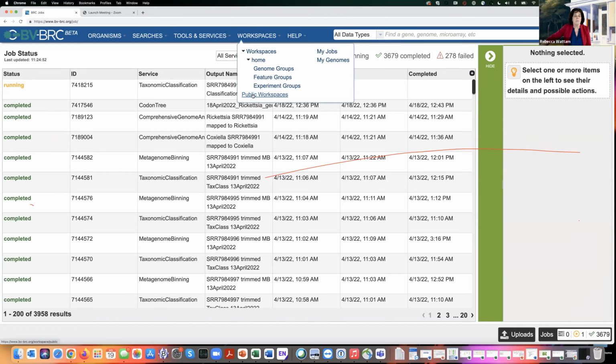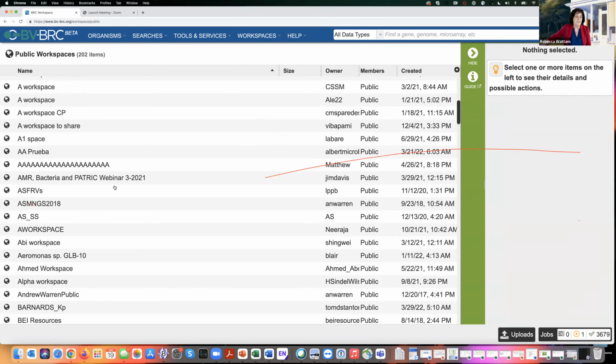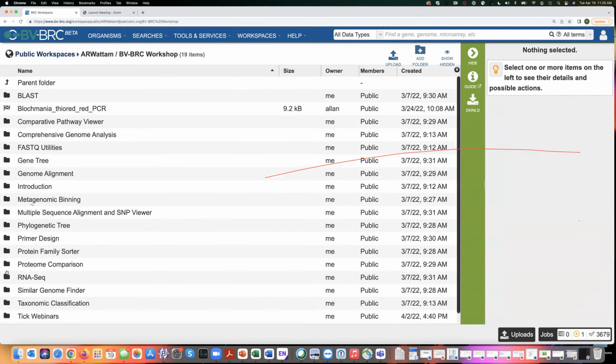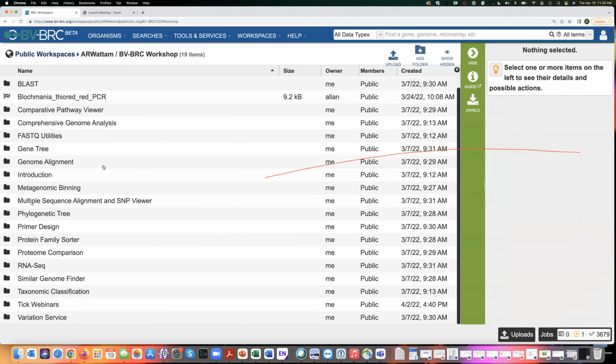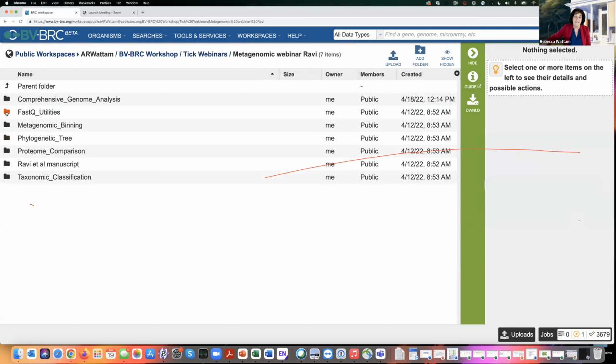So let's click on public workspace, and then we scroll down until we see BV-BRC workshop. Click on that. And then we scroll down to tick webinars, click on that. And then for the metagenomic webinar, we click on that. I know it's a lot of clicking, and I'm going to be doing it a lot, so gird yourself for that. The manuscript I've made available here for you, so you can look at it here.